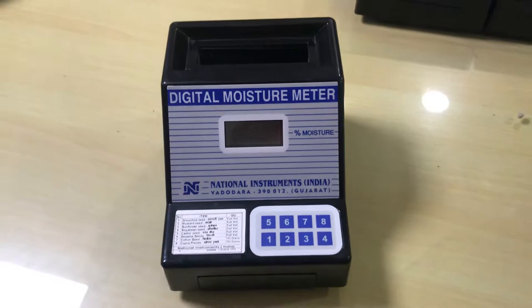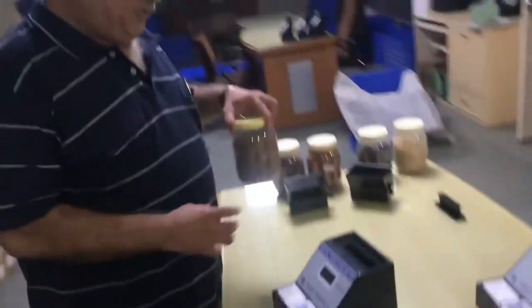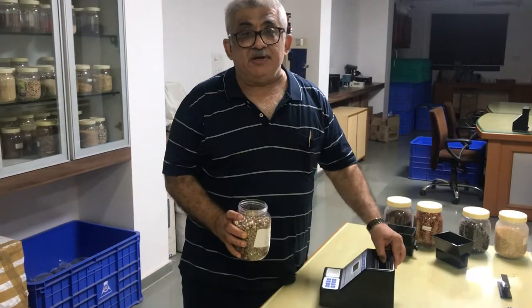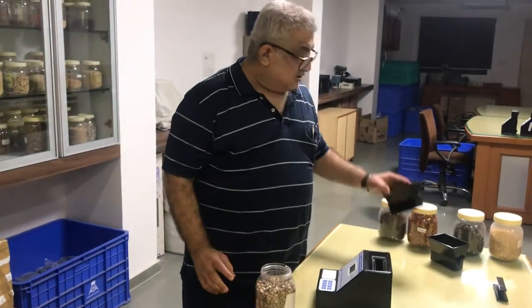Now, today I will demonstrate how to measure moisture content in Castor seed. This is a hopper.